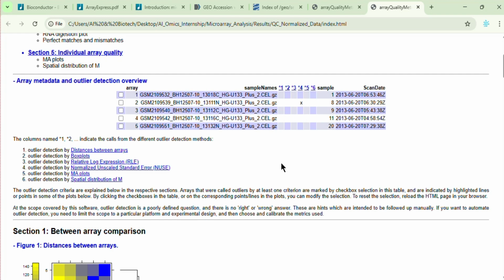it is only indicated by one method. And given that biological variability is expected in such a dataset, there is a possibility that the sample was identified as an outlier for that reason. The discrepancy may not necessarily represent technical variability. Instead, it could reflect true biological variation, maybe a difference in tumor stage. This is a tumor sample that is different from other tumor tissues. We consider it appropriate to retain this sample for downstream analysis. Also, another reason to keep this sample is that we will use the same dataset for a machine learning application.